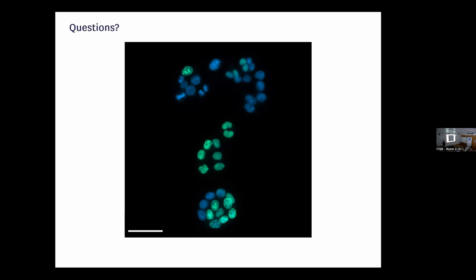Okay. So I have a question regarding FRAP. Can you couple FRAP or use FRAP to study the regeneration of organelle damage, for example? And can you couple the photobleaching radiation to radiation that will cause that damage in the organelle? To contextualize a bit, I work with nanoparticles, so I accumulate them, and by exciting the nanoparticle at a certain wavelength, I could heat them up and cause organelle damage. So I was thinking if I could couple that wavelength with the photobleaching wavelength of a certain fluorophore, and visualize the recovery of the damage or the permanent damage through FRAP.